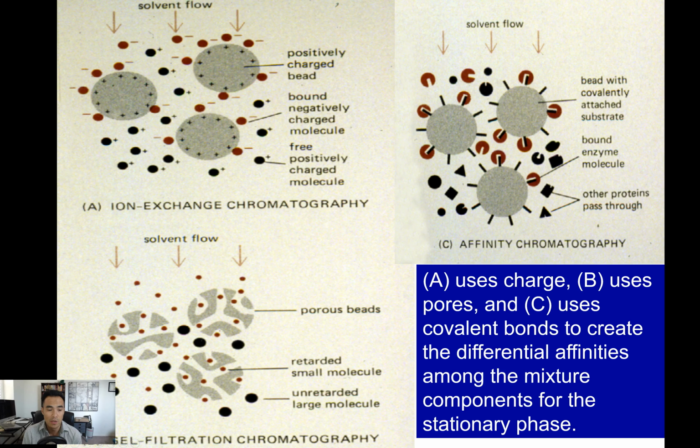In this video, we're going to talk about the post-lab discussion for chromatography, specifically paper chromatography, and some of the concepts involved in this lab. So let's talk about what the results showed. By now, you should have already collected various different dyes and how these dyes traveled across the paper.